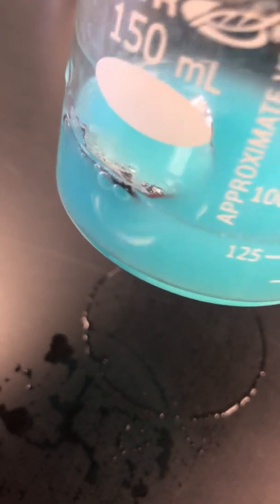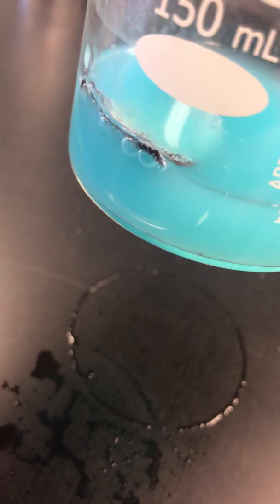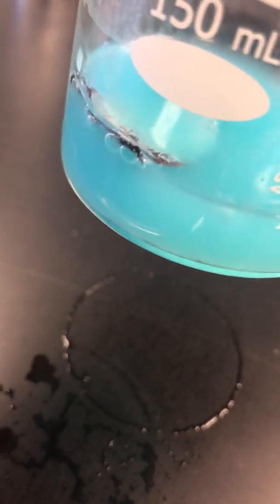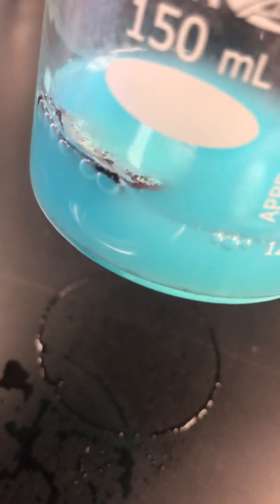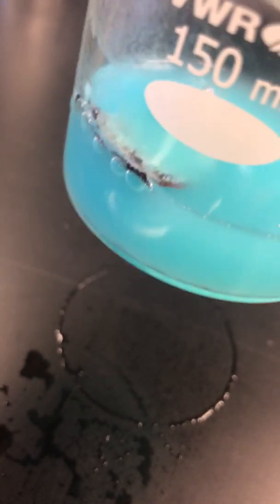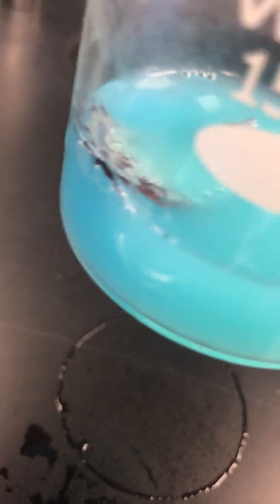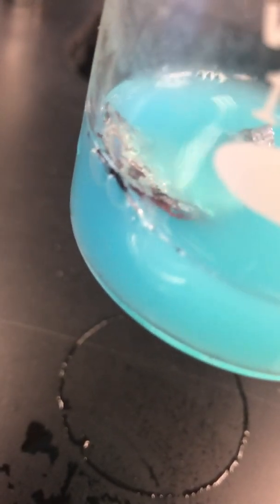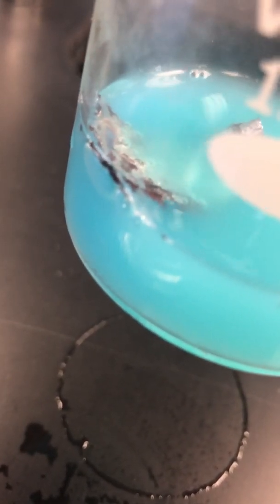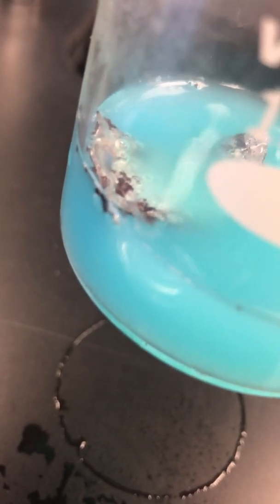So how do we know this is a chemical reaction? Well, there are a couple of ways. Bubbles are forming, which means a gas is being produced. There's an unexpected color change. Gray things don't just become red or black, not normally. And you can't necessarily tell because you're not here, but the glass that this is in is actually starting to get a little bit warm. It's getting hot. So that's also telling us that a chemical change is happening. Man, it's really starting to fizz a little bit. Cool.